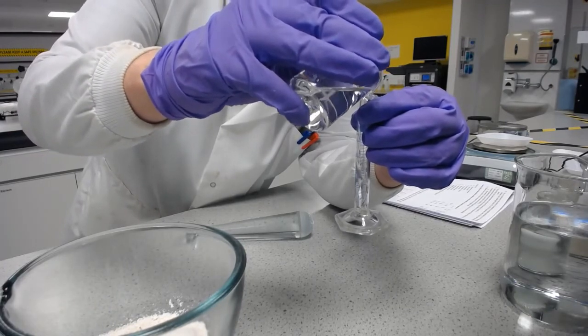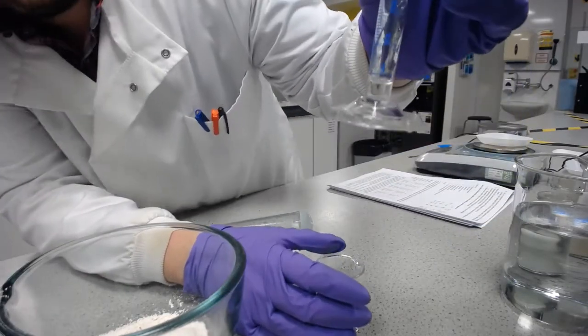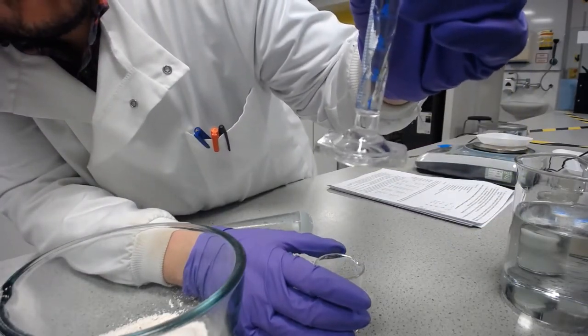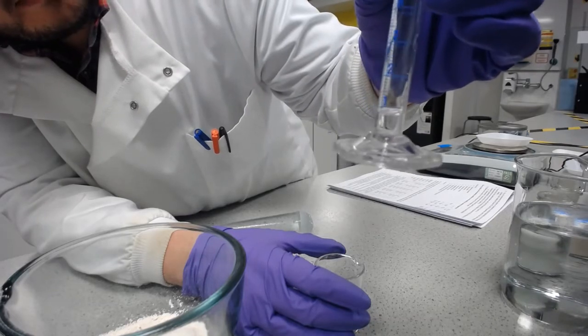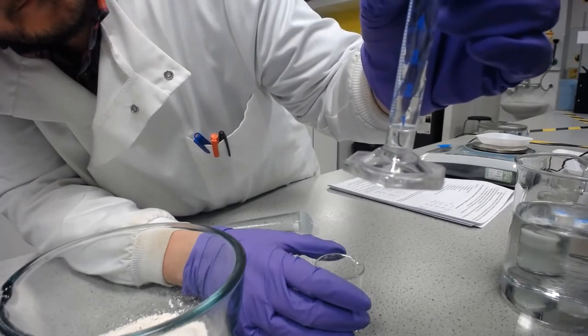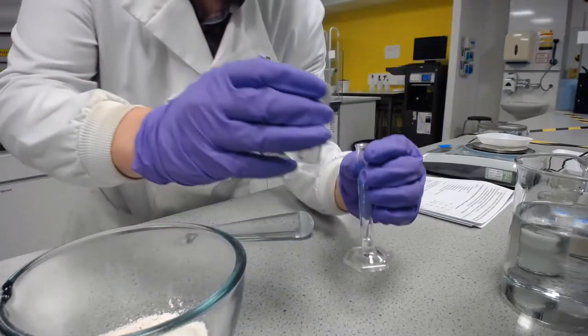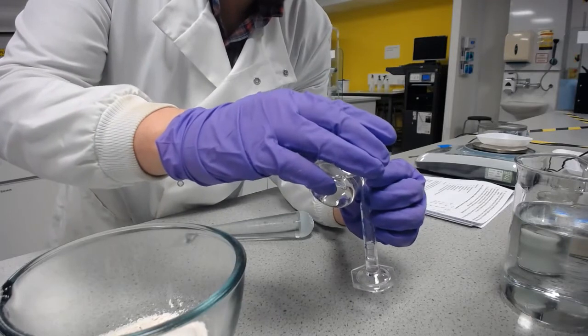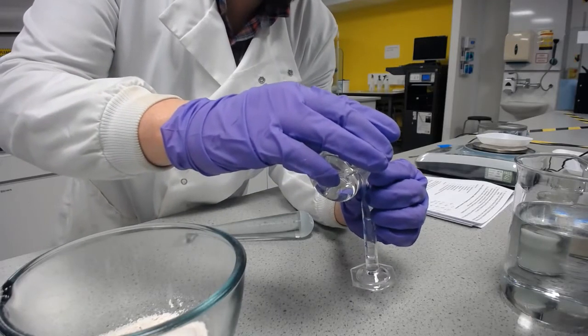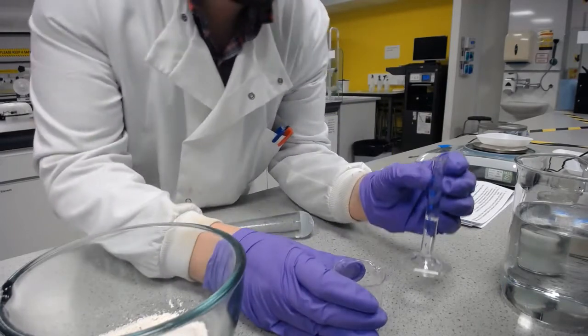But it will take a while for it to reach the bottom of the measuring cylinder. So whilst I'm not pouring anymore, I need to allow the rest of this to come down because the volume is still slowly rising, which hopefully you can see. And equally, when we get this out, we're going to have to let it come out for quite a while as well to make sure we get it all from there.